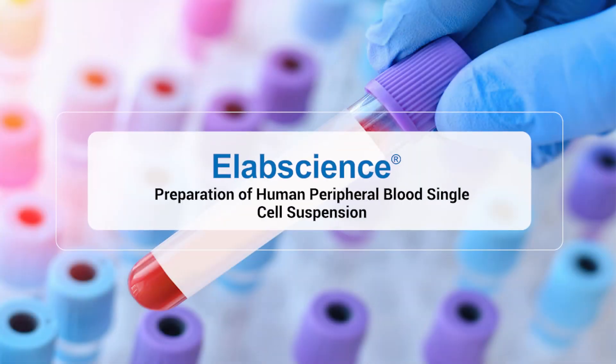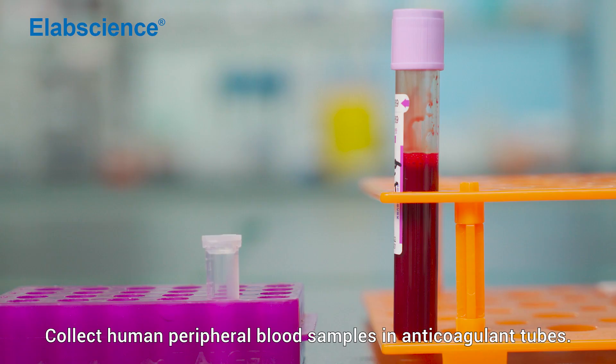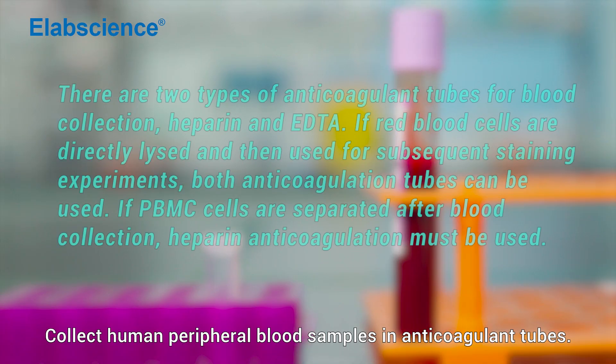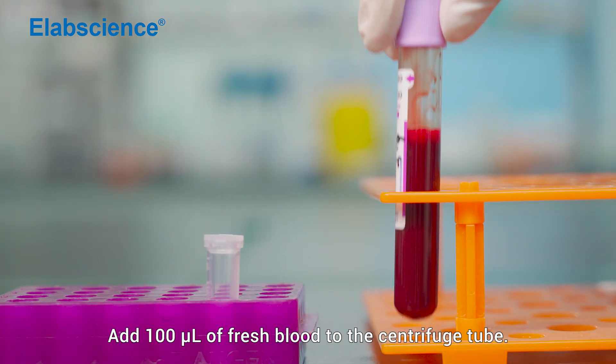Preparation of Human Peripheral Blood Single Cell Suspension using lysed erythrocytes. Collect human peripheral blood samples in anticoagulant tubes. Add 100 µL of fresh blood to a centrifuge tube.